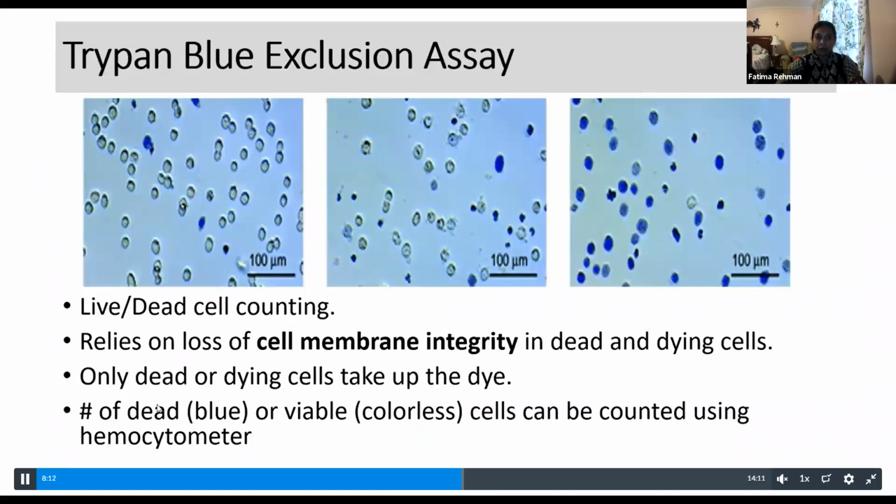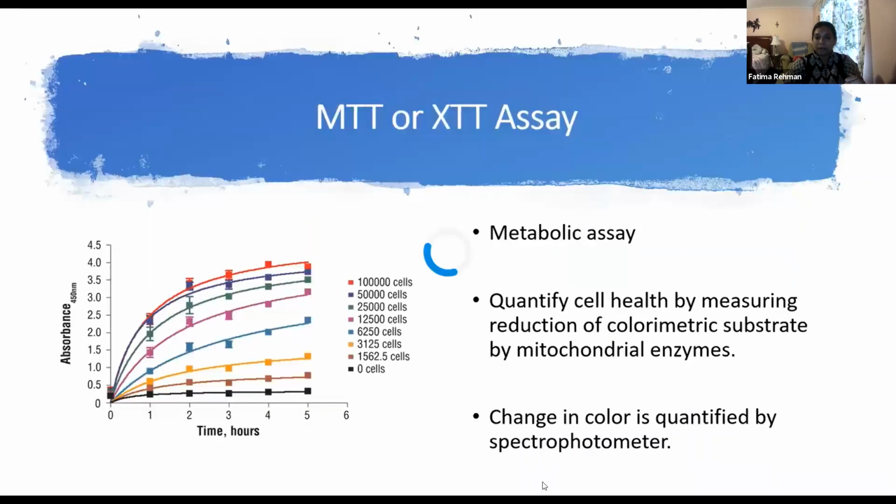Okay, so then you have your trypan blue exclusion, which you all already know about, with the clear and the blue. Here you can see those glassy cells that I was talking about, right? They have a little shape to them, but they're clear. Those are not blue cells. And you will have some cultures today, some images today, that show cells like that. And that was a little bit confusing yesterday for some students as well. But these glassy looking cells are clear cells. And these with either a light shade of blue or dark blue are the dead cells. So it's not like completely colorless.